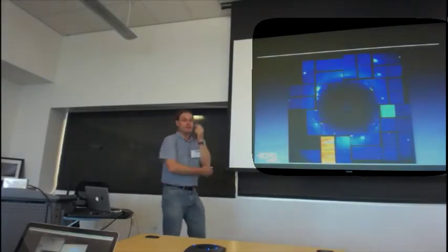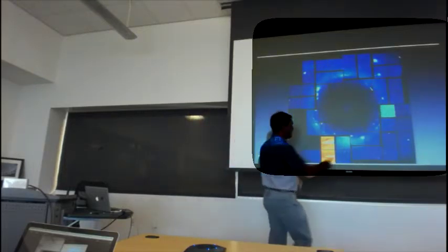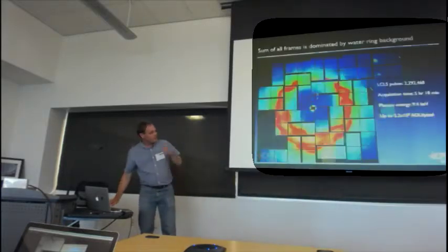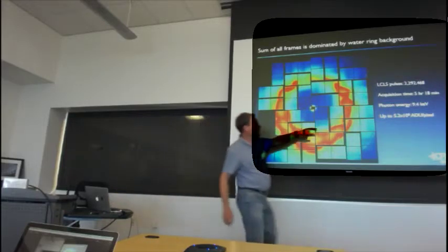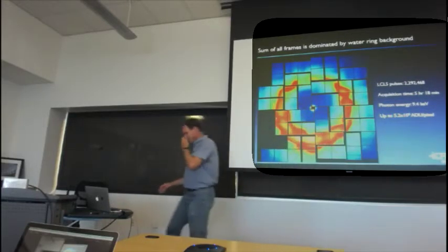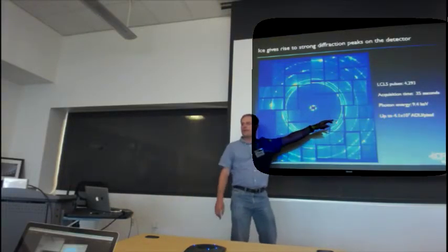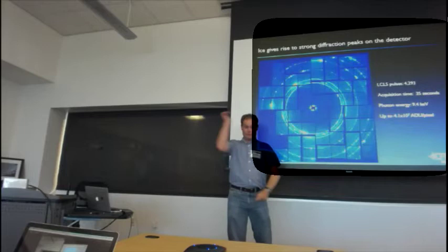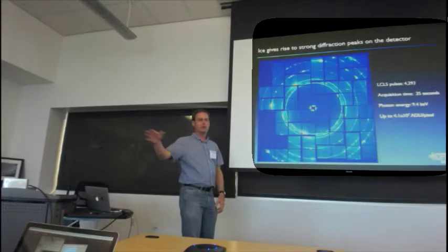Periodically, we've come to do an experiment, and there's been sheepish words. The last group shot a laser at the detector by mistake, and now these two are not working, and the offset on that is wrong, and all sorts of things. Because if you add up just crystal diffraction, this is about 5 hours of data collection, and if you sum it all up, you get about 10 to the 8th ADU per pixel. But if you run 35 seconds of ice, you get pretty close to the same value. And what you find is your beamline scientists, the minute they see this, throw the stoppers in, put the attenuation in, turn it down to less than the flux of a synchrotron, and before you know it, you've got a wimping along experiment.